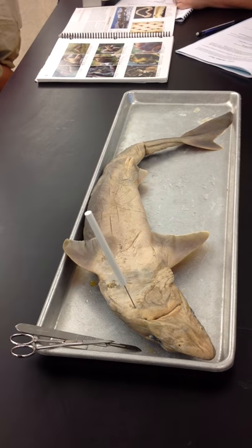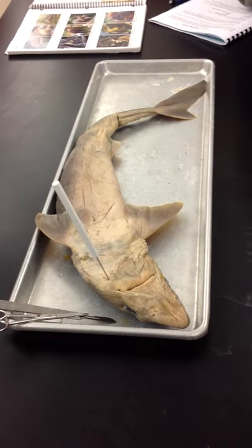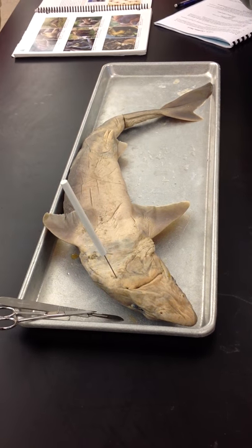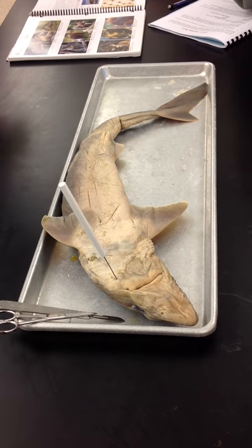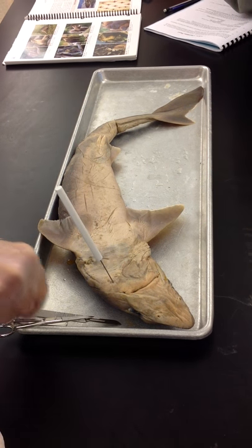Females will have something that kind of looks like that, but it's much, much smaller because it's not functional in females. The male claspers are very much enlarged so that you are able to grab onto the female. Those are all the exterior structures.